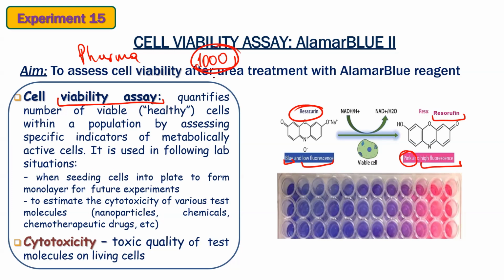And what you do, you have the cells that you seed in your experiments, and then you see if these cells die because we add these chemicals.